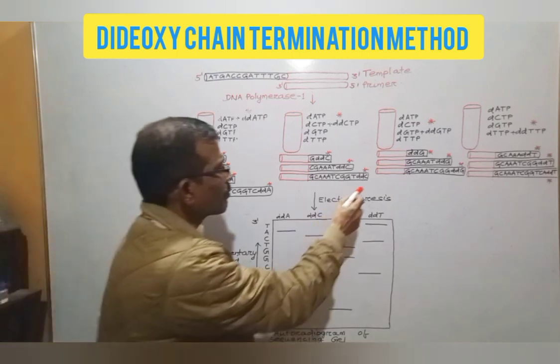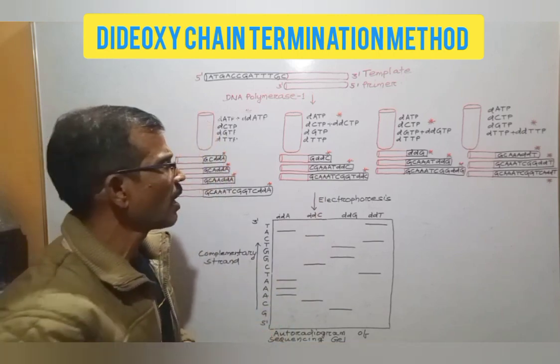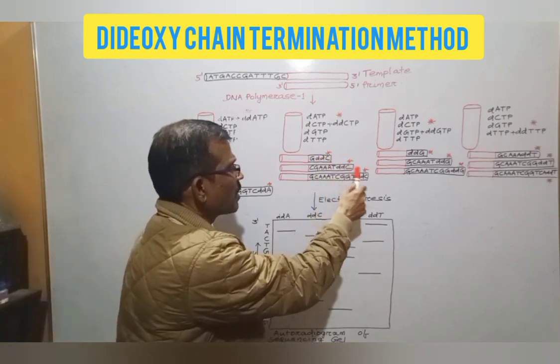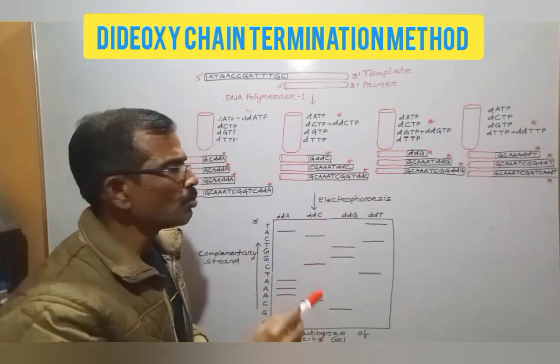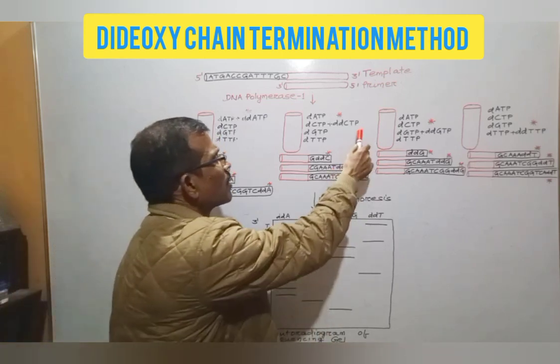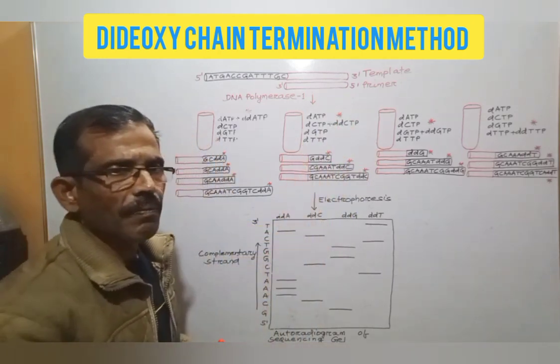Similarly, all the fragments that are obtained from batch 2 chemical reaction will have dideoxycytidine triphosphate at the 3' end. This is due to the presence of dideoxycytidine triphosphate in the reaction mixture.